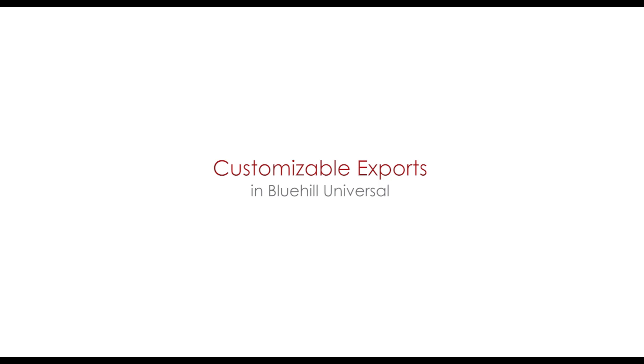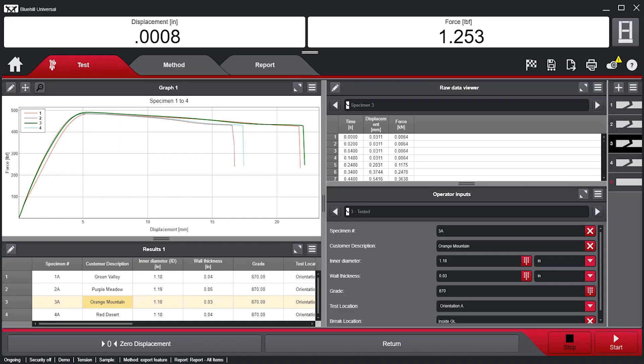Customizable Exports. In Bluehill Universal, users can customize export information to include test results, method parameters, and raw data.